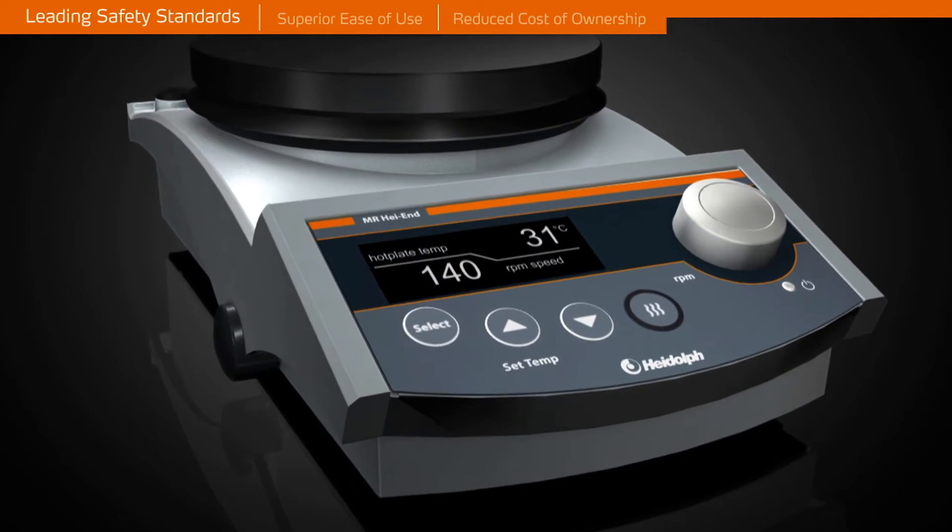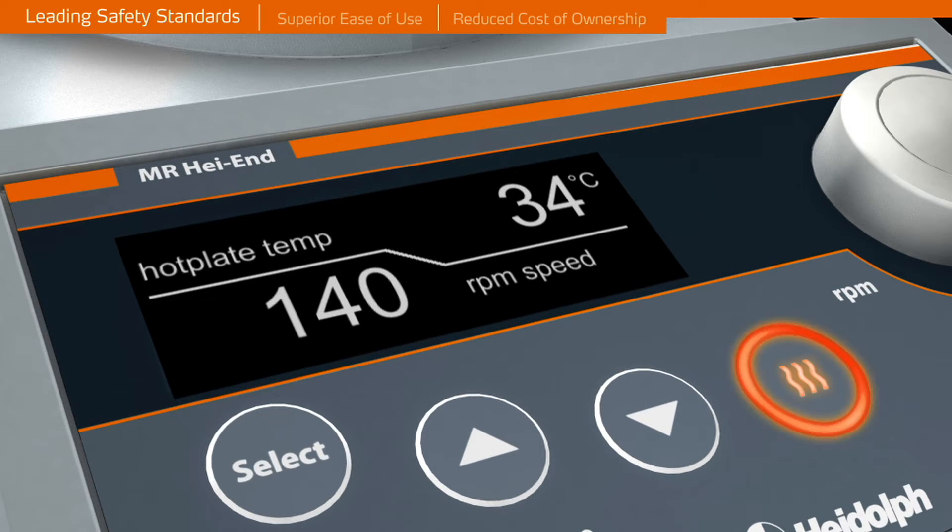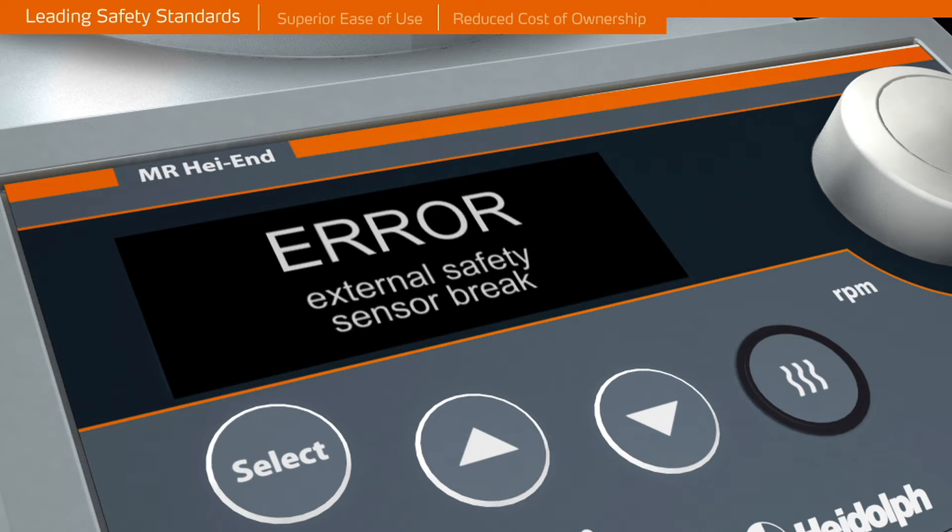A separate on-off button for heating prevents unintentional heat-up. The button is illuminated for visual control. An overheating circuit switches off the hot plate if overheating occurs. The unit will also power off in the case of a short circuit, damage to the temperature sensor, or a motor failure.